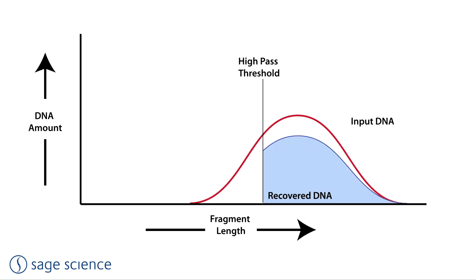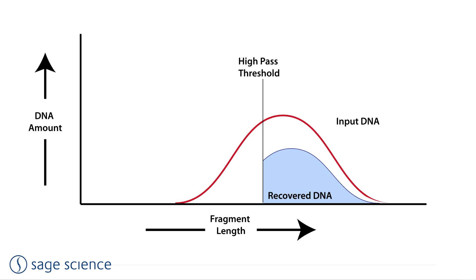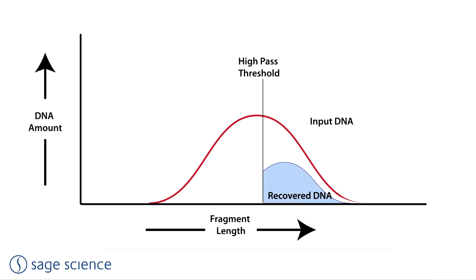The high-pass protocol can have a large effect on yield since a substantial amount of input fragments are removed. It is important to manage the initial DNA fragmentation conditions and to work with fresh DNA samples. As illustrated here, if the input fragment distribution is not centered around high molecular weight molecules, the high-pass could significantly reduce product yield.